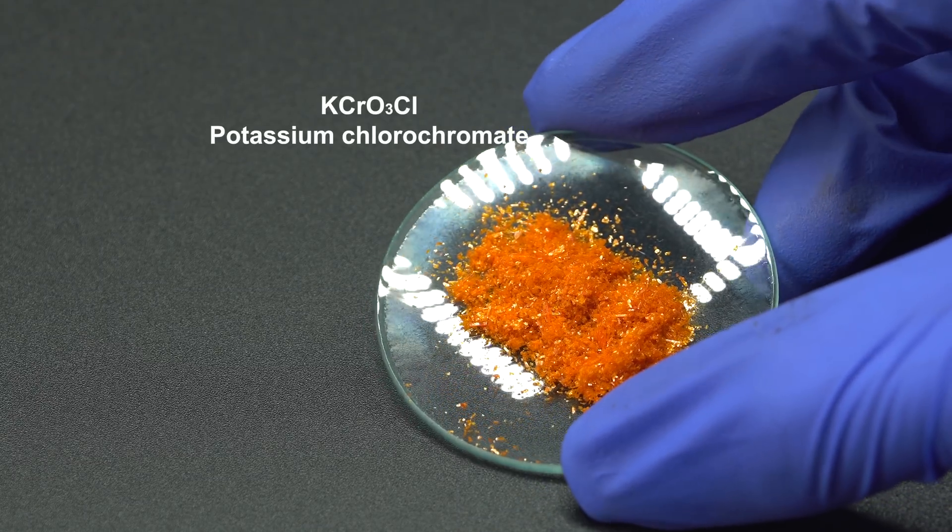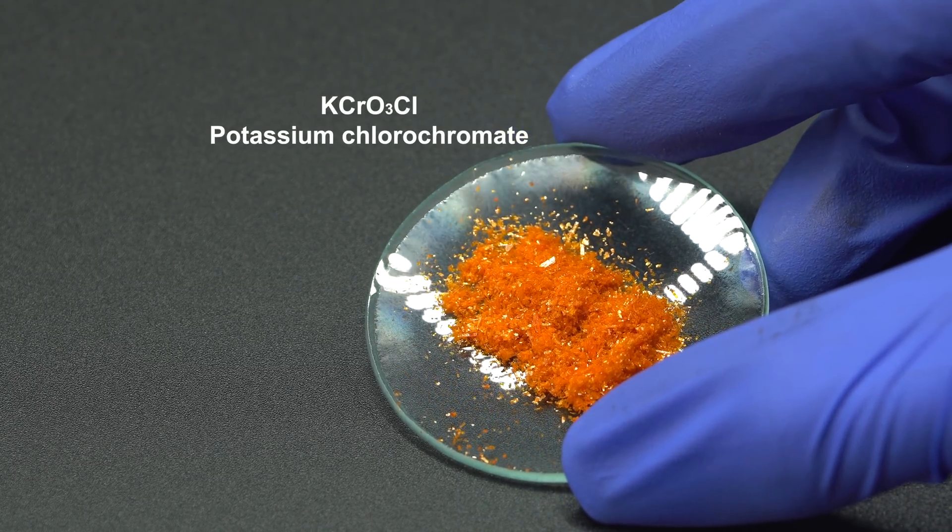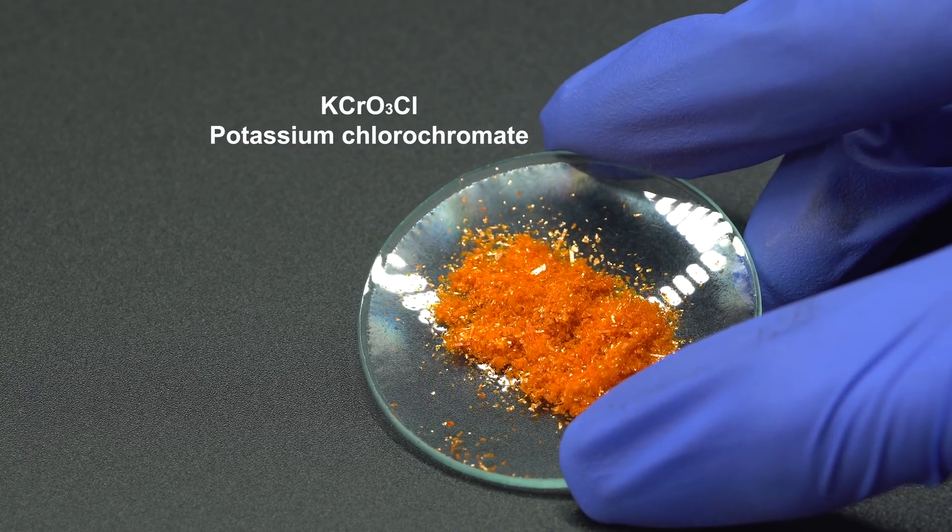Chromyl chloride is easy to get very quickly at the lab by adding potassium chlorochromate to concentrated sulfuric acid or oleum.